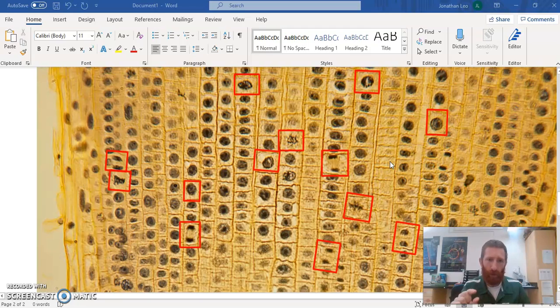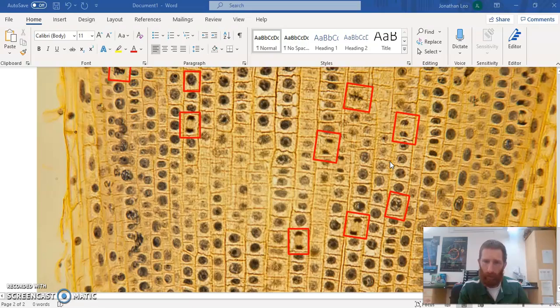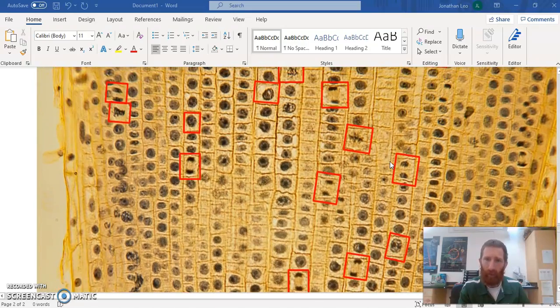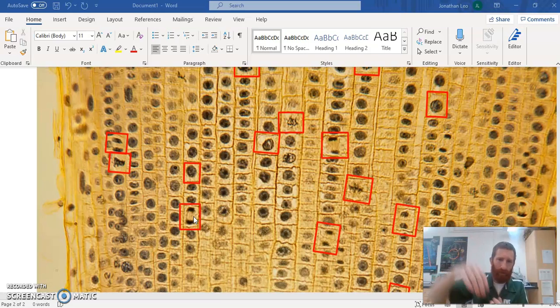Anaphase is the shortest one, so that's pretty hard to find. We have a lot of late anaphases, or maybe directly into telophases here. I would say this one right here, we can still see a little bit of the chromosomes. They're just getting done pulling apart. So that's late anaphase. That's a good anaphase right there. It's not perfect, but you can kind of see it.